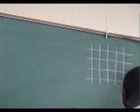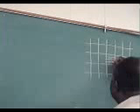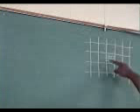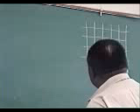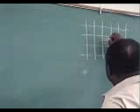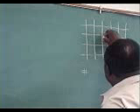The hemocytometer, and most of the time for yeast, because the cells are so small, we usually count the number of cells in that middle one. Count the number of cells in this middle grid and multiply them. Actually count like 5 squares in that middle one. And so you got your total.